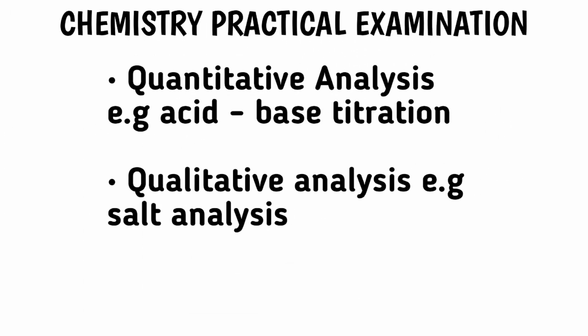Before we look at the various samples for the qualitative analysis aspect of the 2024 Chemistry Practical Examination, here are certain tips that should be noted about the practical examination. The practical examination is divided into two parts, which are the quantitative analysis, that is the acid-base titration, and then the qualitative analysis, which is salt analysis. And then you'll be asked a third question, which is a random question from any aspect of chemistry.